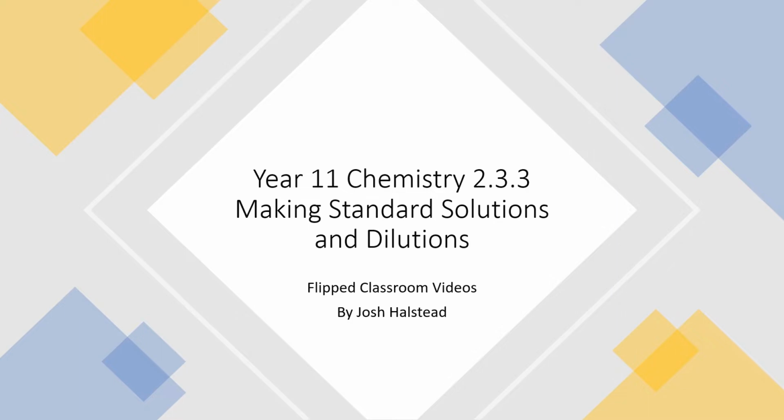So I guess the idea here is to show you some of the processes, but we'll look at this in much further detail when we get stuck into it in class. This is going to be in two parts. The first video is going to be about making standard solutions, and the second part of the video is going to be about performing dilutions. And that's going to be done over 2 lessons. So let's get stuck into the first bit.